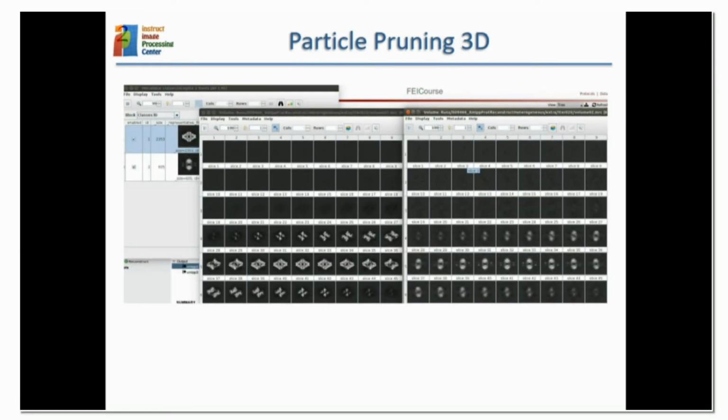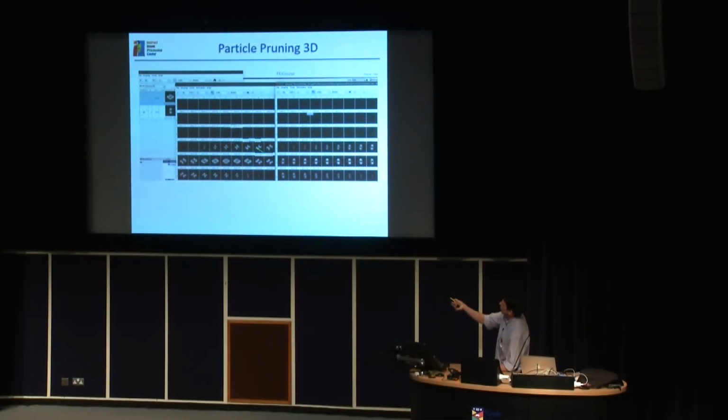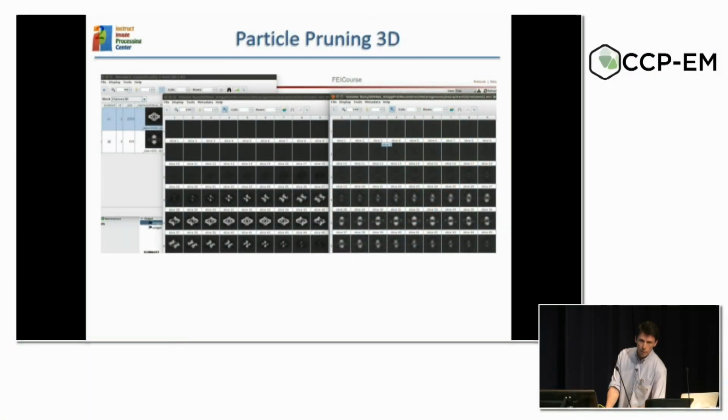From the Xmipp point of view, they are not homogeneous. Some of it, 2/3 or 3/4 I think, of the data go to the correct structure, but still 1/4 of the data is refined into this thing. So you have data in your data set that doesn't really conform to your structure. So again, use different tools because the failures of one will not be the failures of the other.